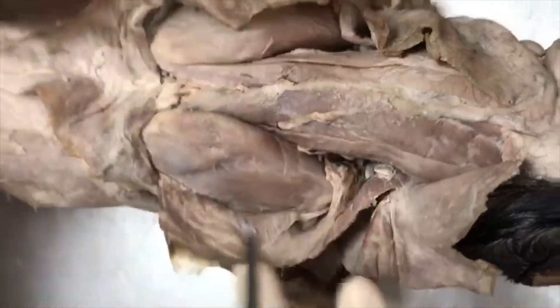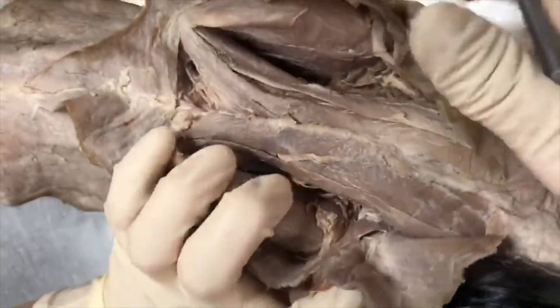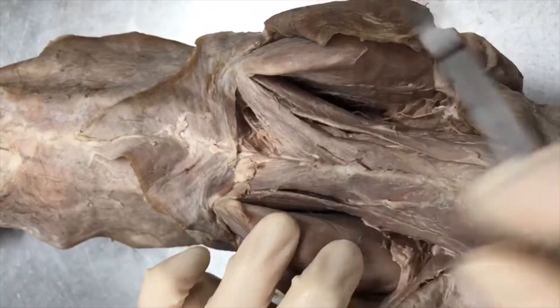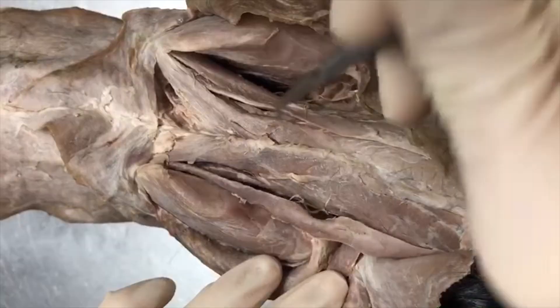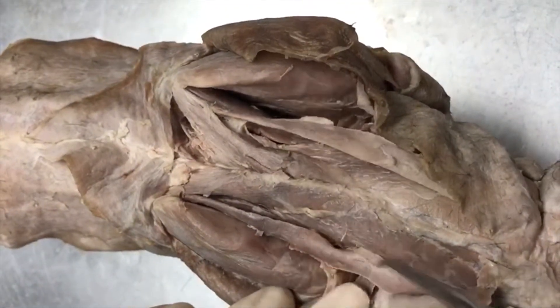If we pull back the acromiotrapezius, the muscles that are between the scapula, here and here, are going to be your rhomboideus muscles. And then you're going to have two long string-like muscles, one and two, on both sides — and that's going to be your rhomboideus capitis muscles.